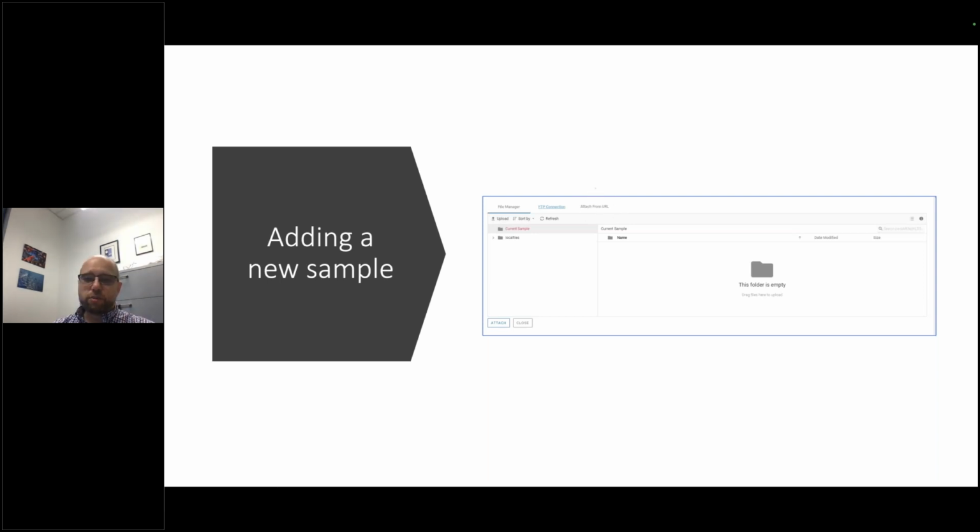In some cases, it's also possible to use SRA identifiers, SRR numbers from NCBI, but unfortunately, NCBI did not come up with a uniform way to store the single cell data, so sometimes it doesn't work. For this, we have a special pipeline that can download data from NCBI. It's called FASTQ download, and it's also described in the preprint.